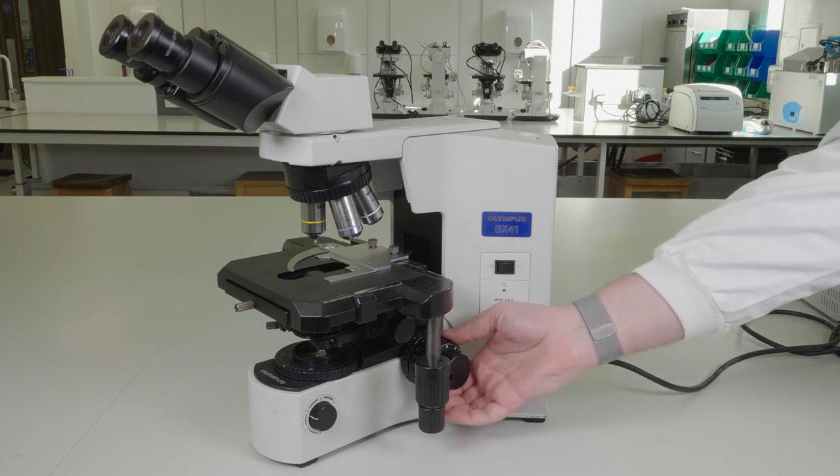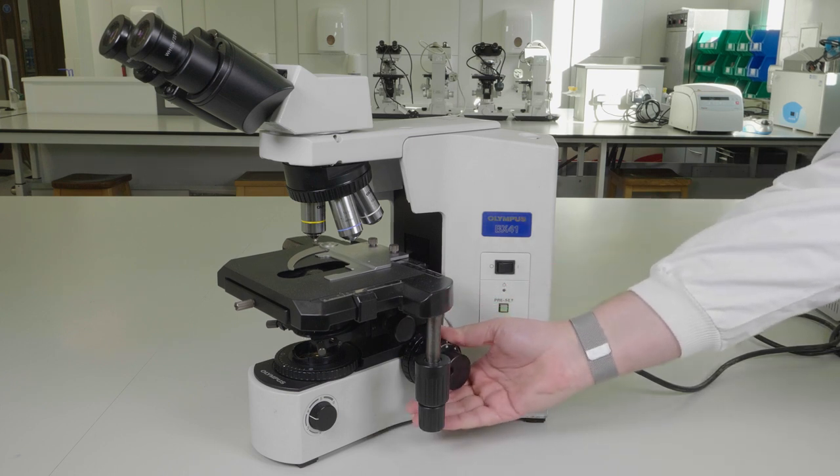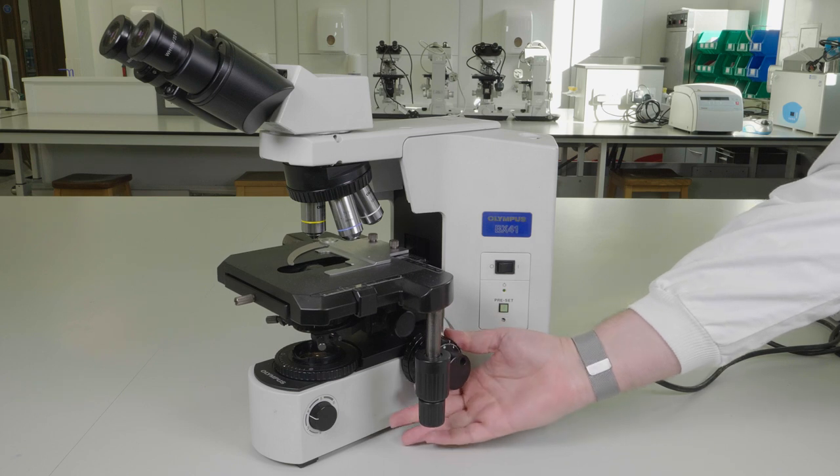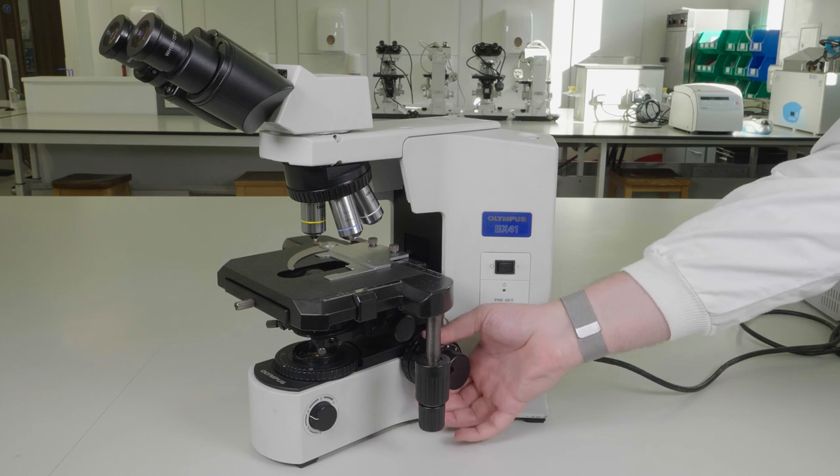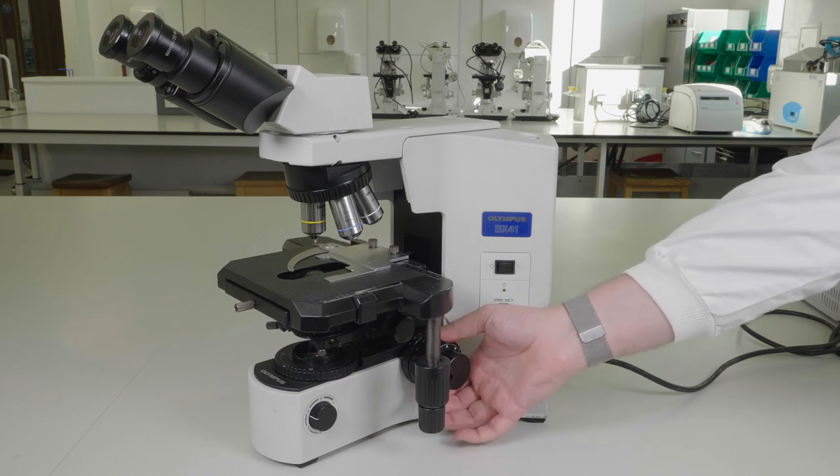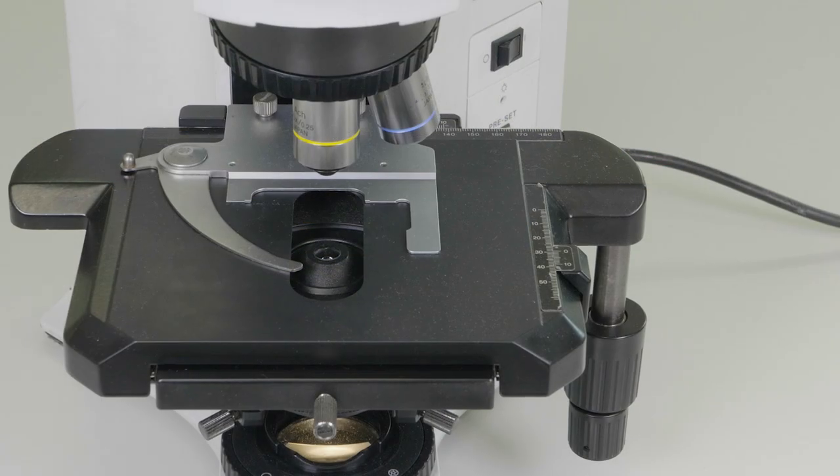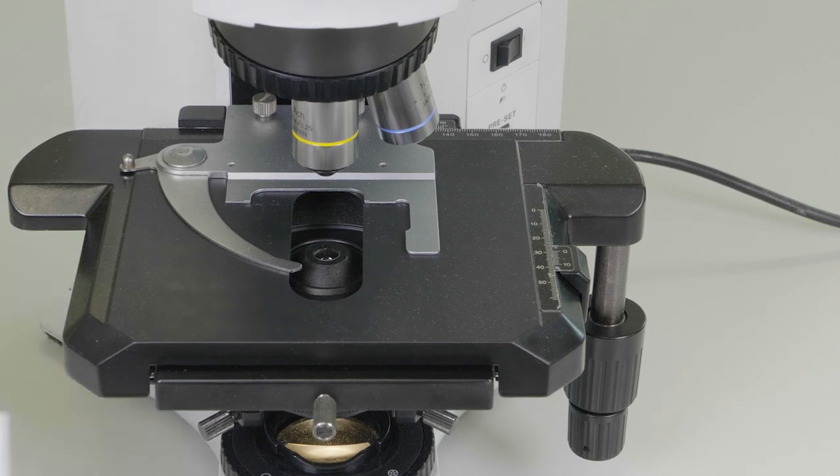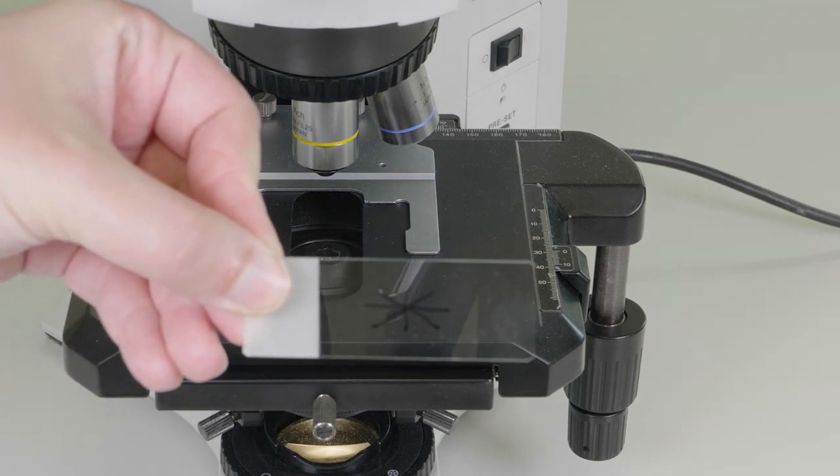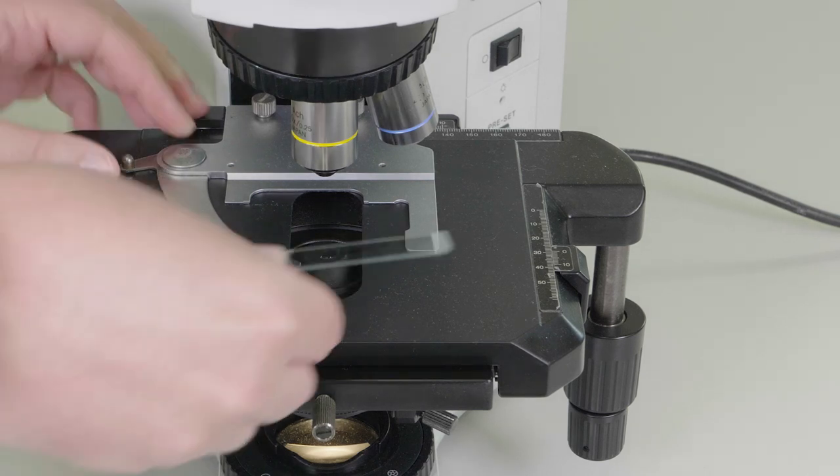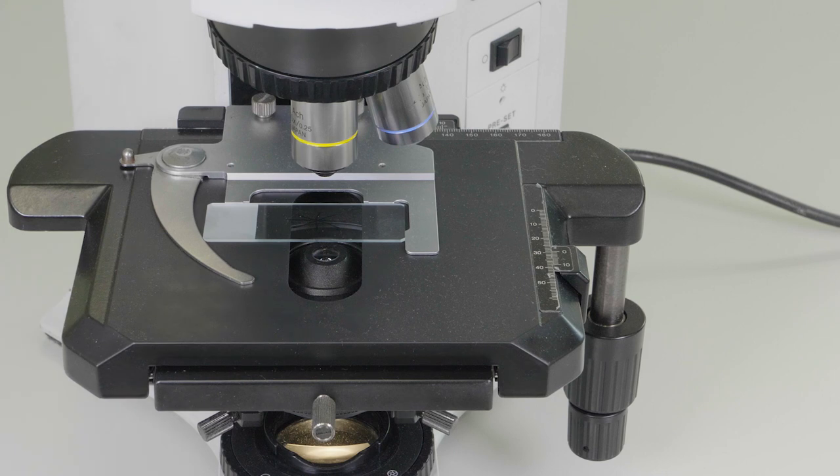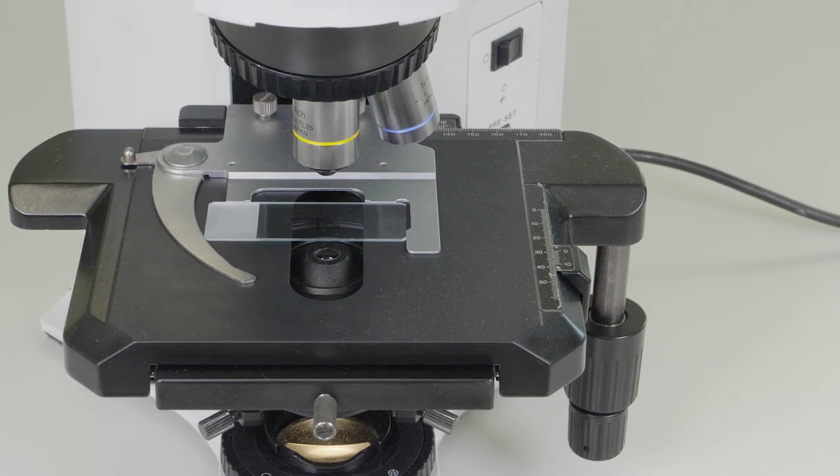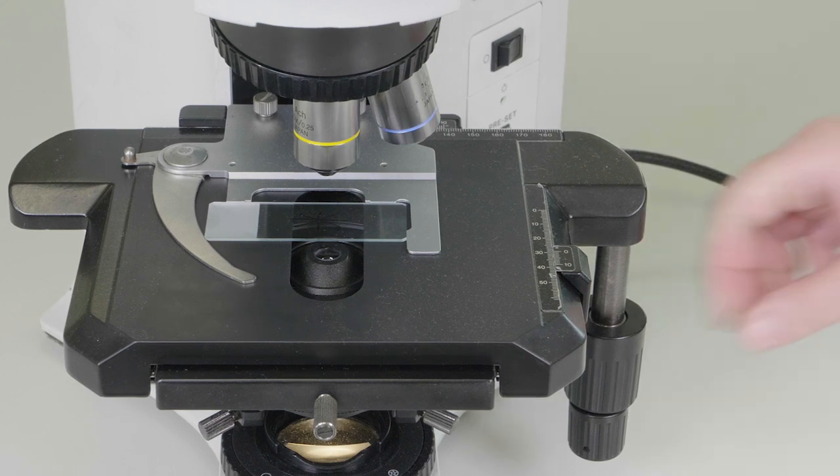Before we continue make sure that the stage is at its lower most position by adjusting the course focus dial. At this point take a glass microscope slide and draw on it with a pen. We will use this to set the focus. Place the slide in the slide holder on the stage and move the slide into the light path using the X and Y controllers on the right hand side of the screen.